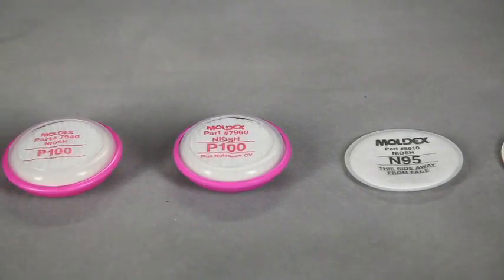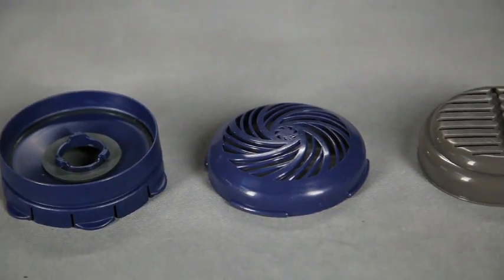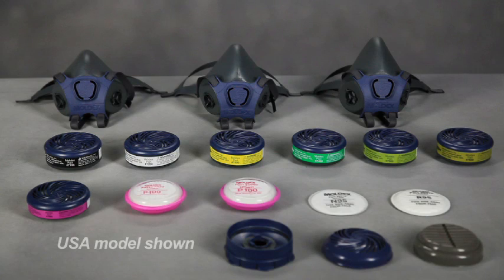These contaminants must have good warning properties such as smell, taste, or irritation. Do not use the 7000 series respirator against any contaminants or in any areas not specified or approved by your company's respiratory safety program.